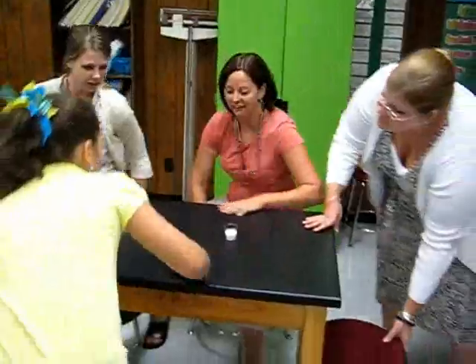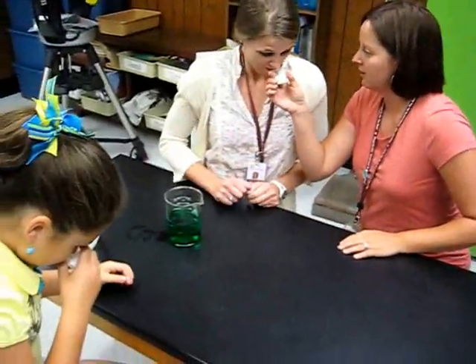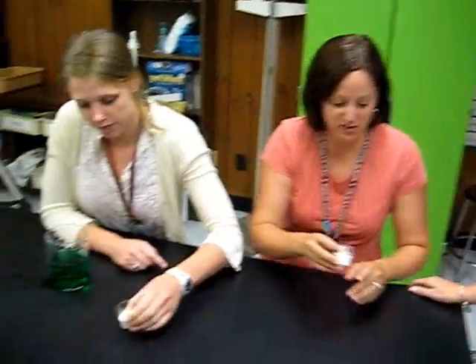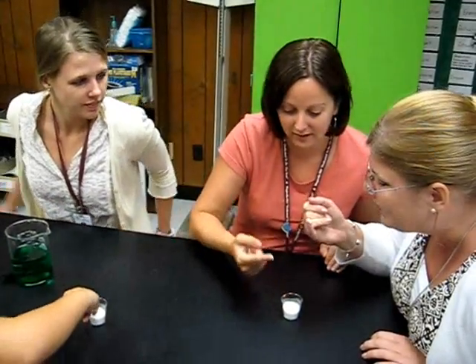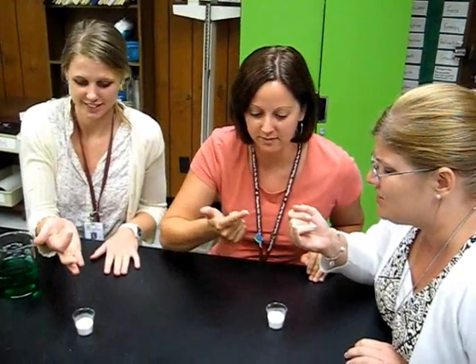There's already stuff stuck on our eyeballs. This looks fun. What is that? Smell it. I bet it's safe. I don't know. This is not cool. Looks good. Maybe we should taste it. What do you think? Yeah, yeah. You should wipe your finger first. I'm going to make sure it sticks. Look at that. It looks like something — salt. You think it's okay? I'm sure it is. Teacher gave it to us.